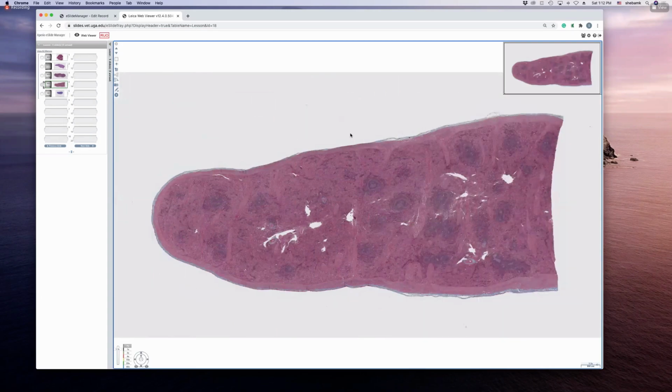See, it's a solid organ. It has a capsule. It has these nodules that are distributed all over, and you can see the trabeculae coming in, but it's mainly divided into red pulp and white pulp. That is typical of the spleen.